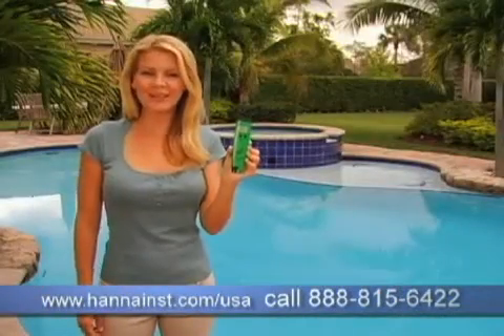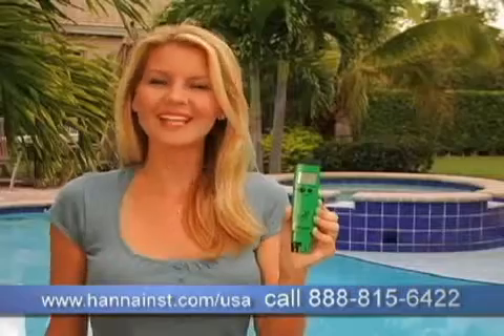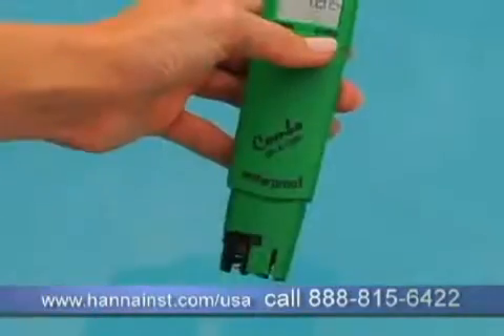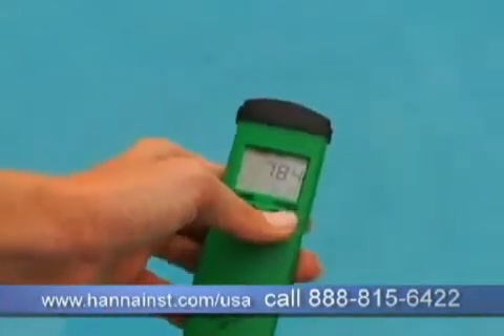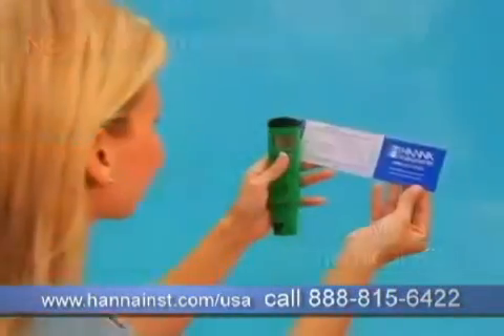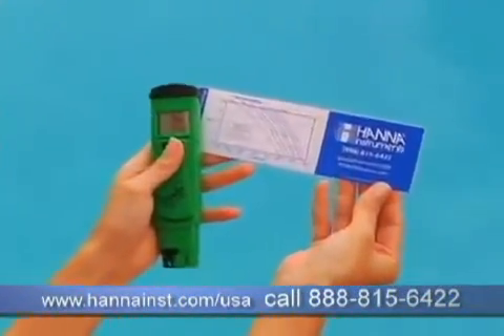Dip and test. Go digital with the Hanna Tester for your pool. It's so fast and easy to use — you literally just dip and test. Dip the Hanna Instruments Waterproof Digital Tester in the water and with a press of a button read your pH, temperature, and ORP. Then check your laminated chart for your chlorine levels.